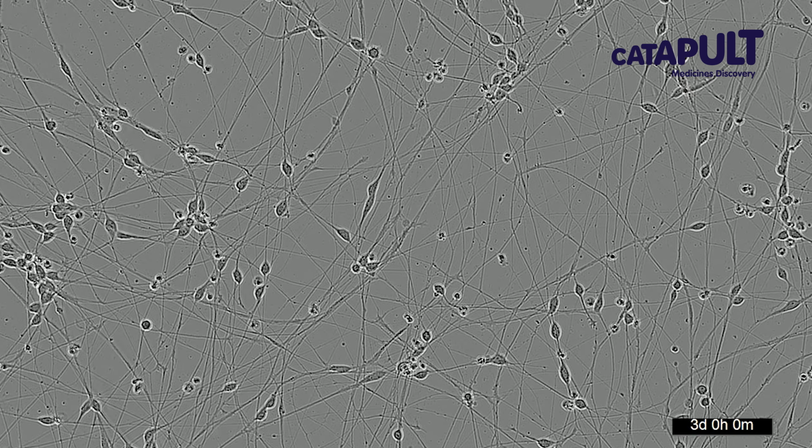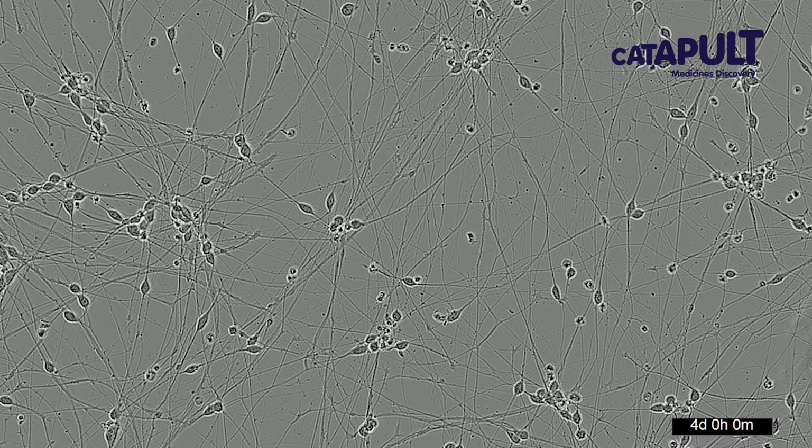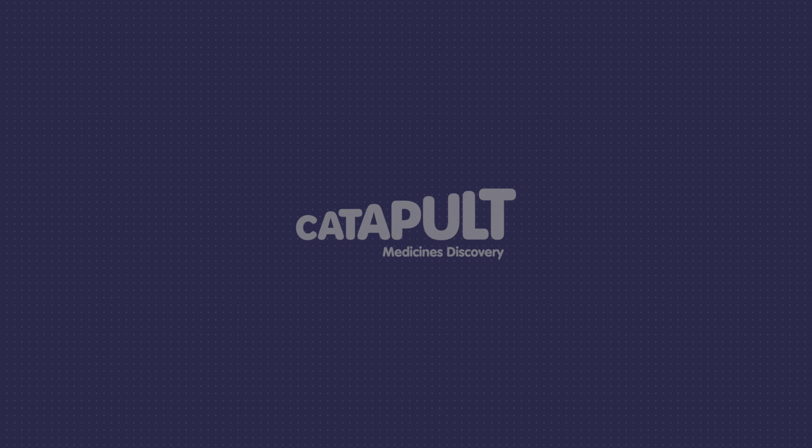We can measure neurite outgrowth and branching dynamics in real time while simultaneously looking at cell viability. This is a really useful method since neuronal growth is perturbed in disease states such as neurodegenerative disease or in response to injury or neurotoxic stimuli.